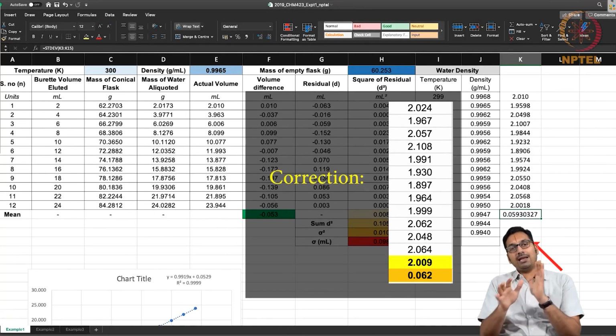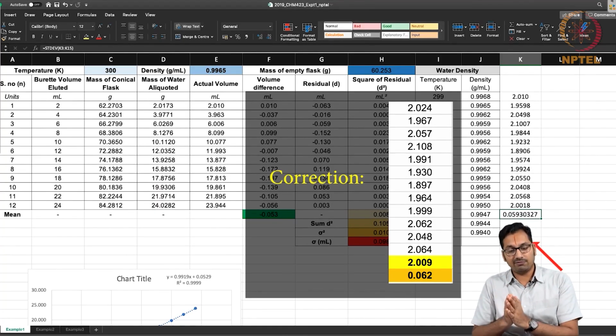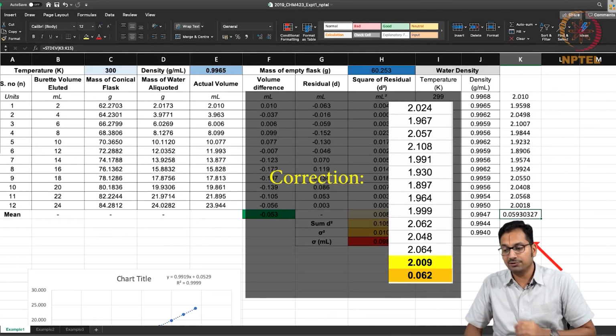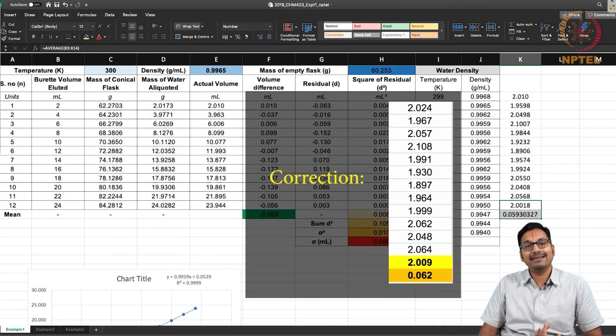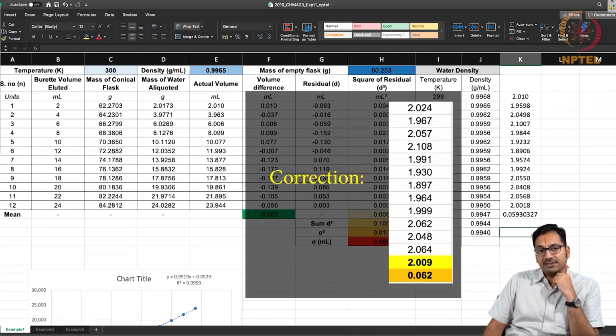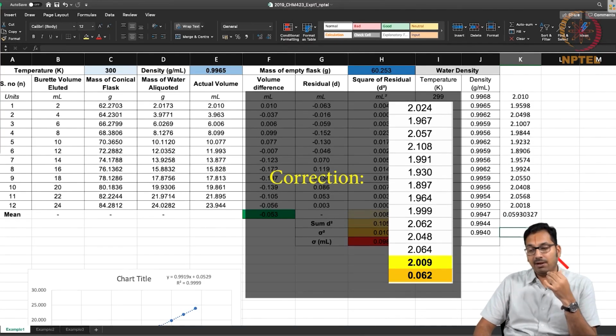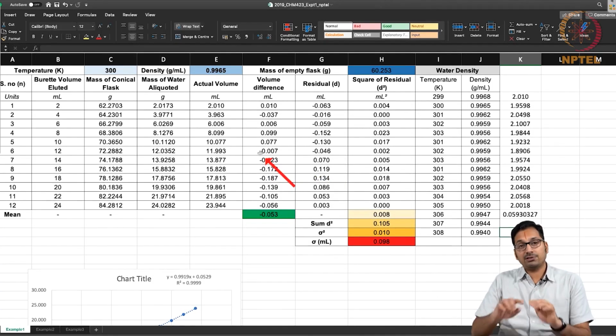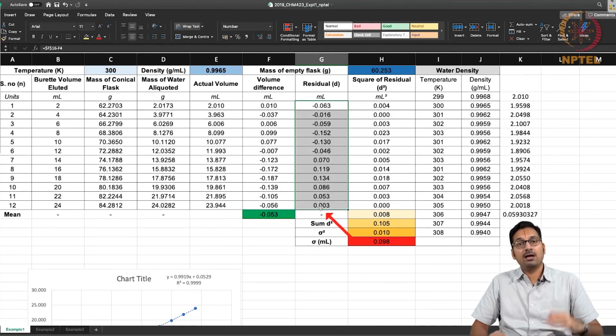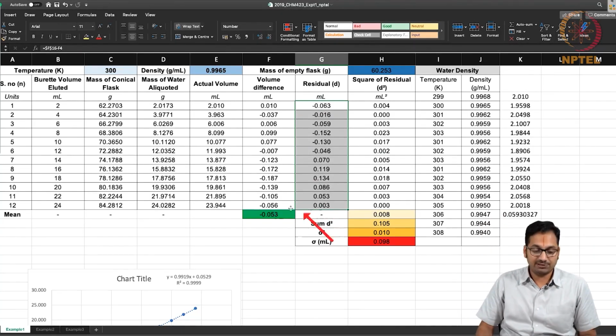So you are able to realize the same analysis could be done in subtly different ways, which give you subtly different values, but overall what you are able to understand here, you had a 2 ml that you wanted to aliquot, and you are indeed getting the average around 2, but your standard deviation is about 0.06 ml, right. So basically you have a variation of 60 microliters in each of the aliquots that you ended up getting. And you are also able to remember the fact that the residuals that came for each of the measurements are above and below the average, which makes you happy.